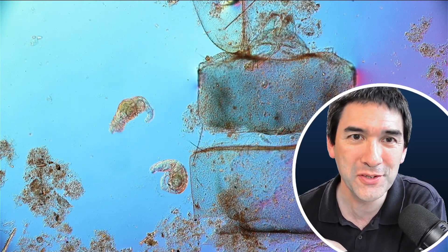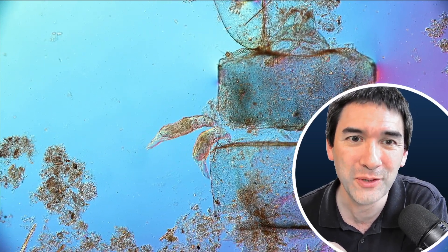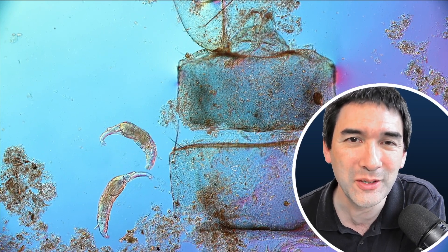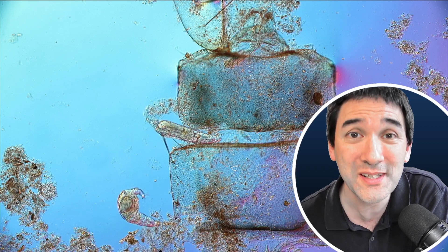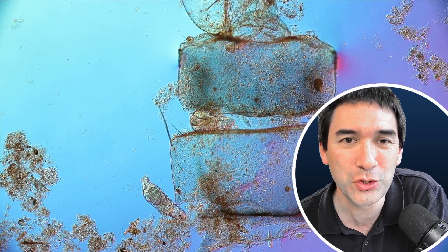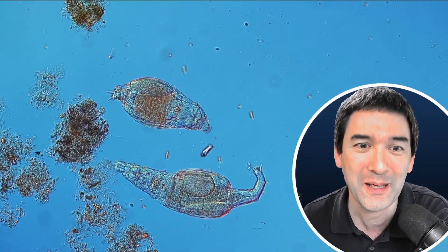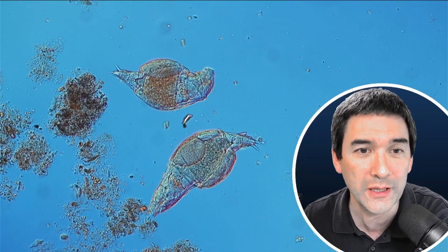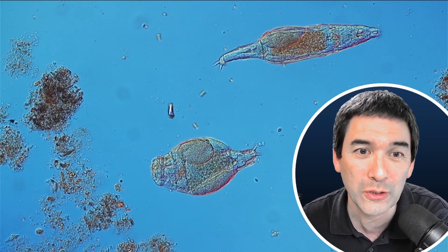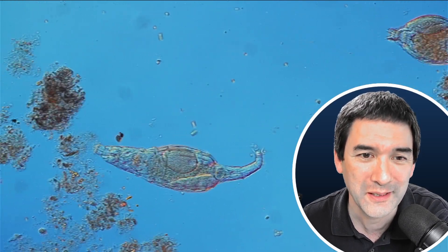This is actually quite a nice size comparison. In the center, the large structure you see is the exoskeleton of some insect, and then there are two rotifers here — you can see how different the sizes are. Inside the exoskeleton, you can also see tiny single-celled protozoans moving around. A very nice example of how decomposition takes place directly in nature. This rotifer is now trying to go into the exoskeleton — quite flexible animals! The bottom one has an oval round structure inside it, which could actually be an egg about to be laid, so it's quite possible this one is in the process of reproducing.